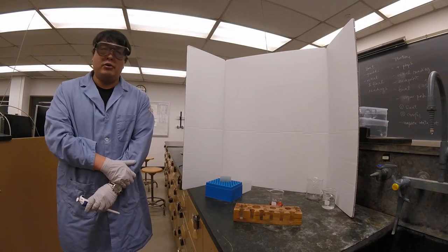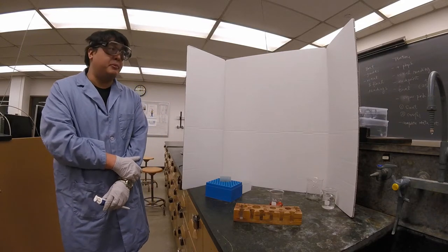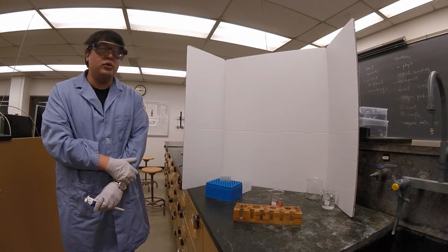In this video, we're going to show you how to use a micropipette and to prepare sample R1, which is your first dilution.